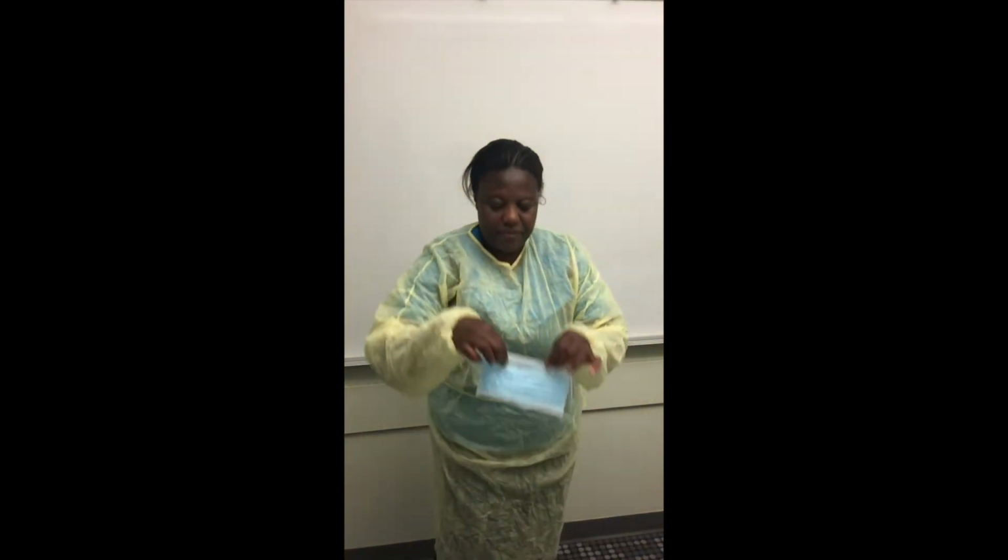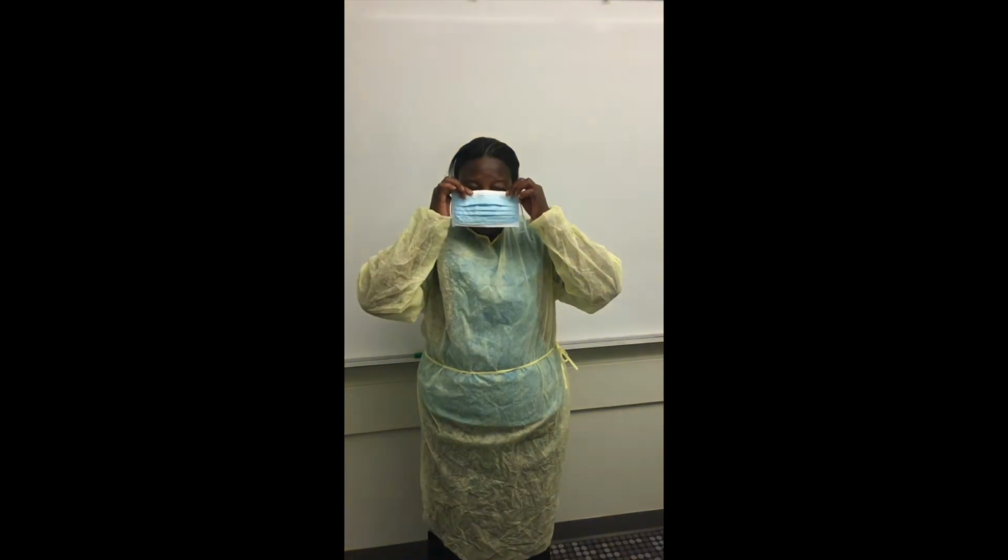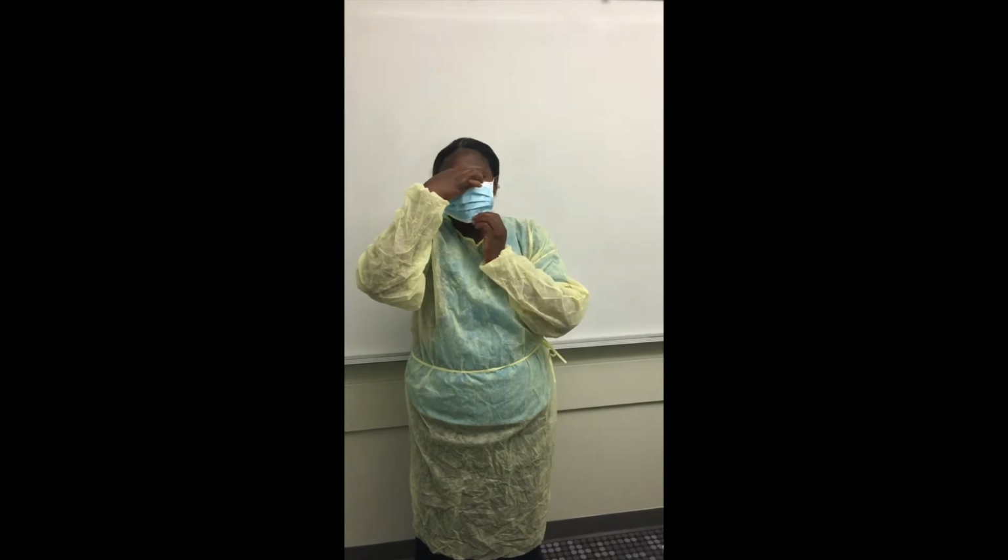Next, don a face mask. Make sure the metal part fits snugly over the nose, and that it covers all the way from the nose to the chin.